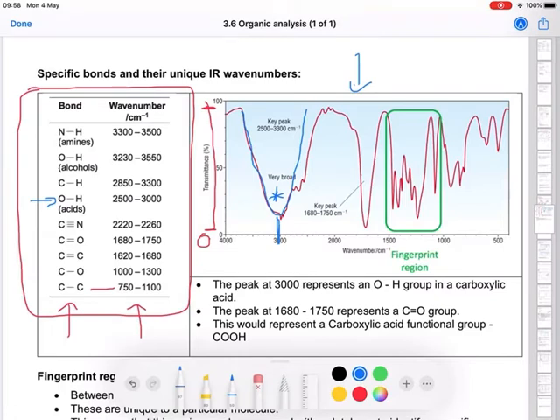And then we've got another peak here. And again, if we look where that one is, it looks like it's going to be this peak vibrating here. So here's the key thing then. We start off and we change our infrared radiation as we go through our molecule. You'll see certain specific frequencies. There's one there, a second one here, a third, fourth, and so on, where infrared radiation is being absorbed due to specific bonds in that molecule vibrating.